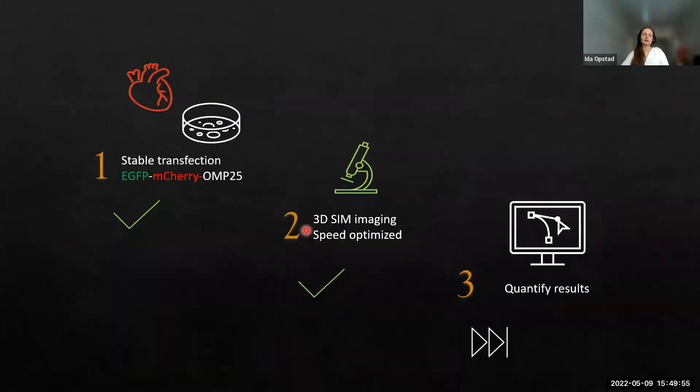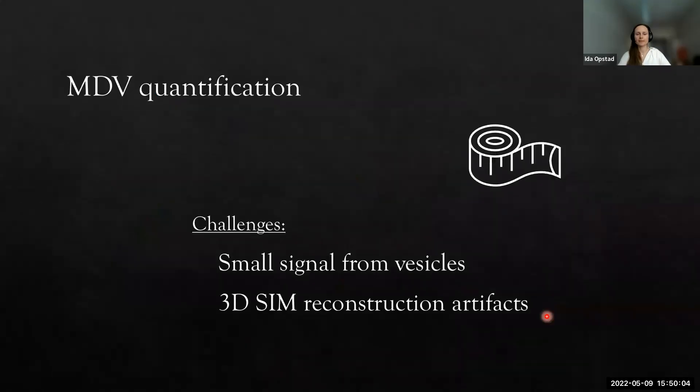We have a nice stably transfected cell line and we have optimized imaging conditions. Let's see if we can quantify the results. The main challenges here are the very small signal from the vesicles in between these much larger mitochondria. At the same time, we have some percent of reconstruction artifacts from the algorithm that can look confusingly like vesicles and have a similar signal.